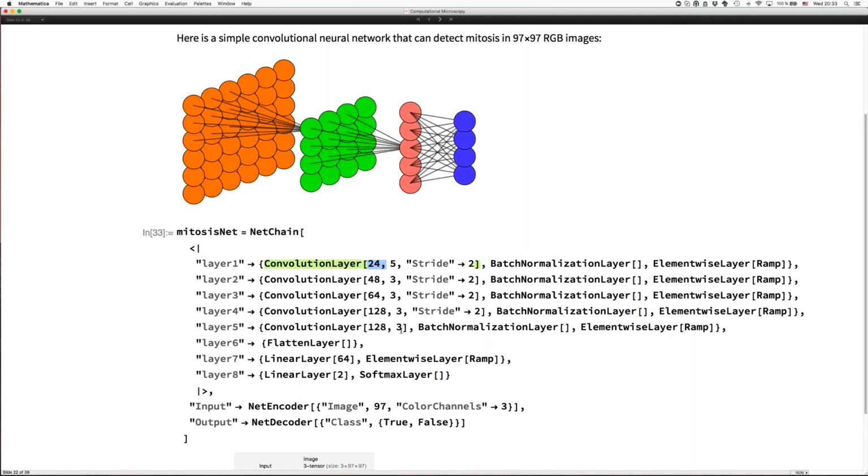And unfortunately, it's a little bit the same way currently in the science of neural networks. Basically, if you are new to neural networks, look for a paper that somewhat does what you want, and look at their neural network, and then you can start to deviate. You can try to experiment if you can get away with fewer layers, if you need layers that are wider, more connected, whatsoever.